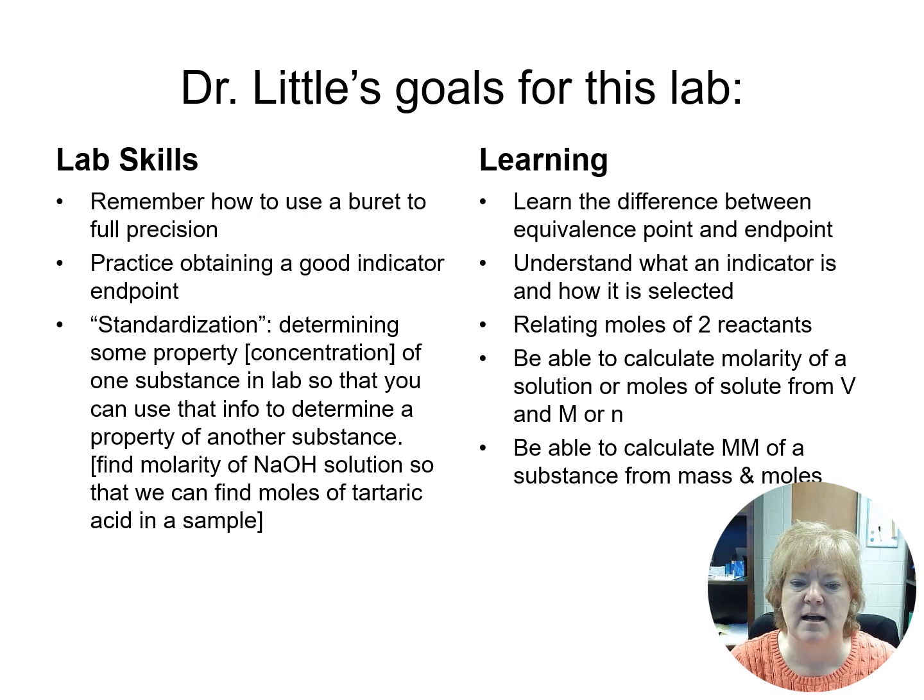In this case, we'll be determining the concentration of a sodium hydroxide solution, and then we'll use that value we just found to take that solution and do something else with it, which would be doing another titration with tartaric acid. In terms of our learning of concepts, this is really stoichiometry review.